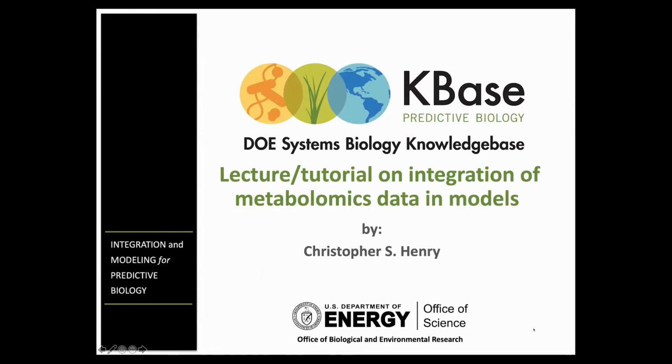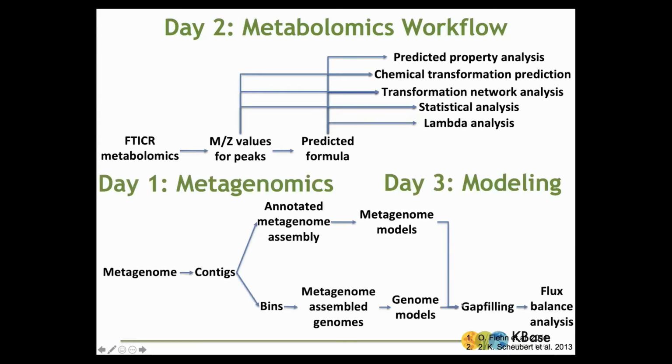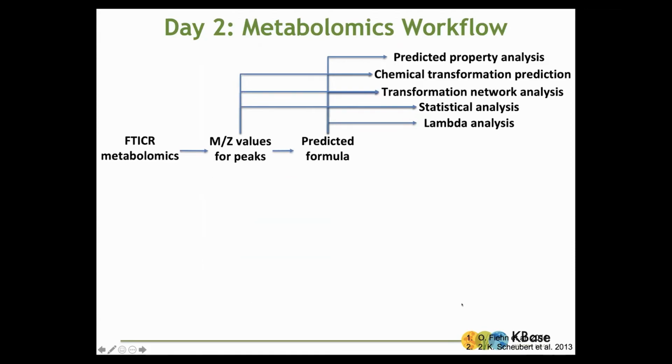All right. Great. So this will be a tutorial on the integration of metabolomics and the modeling. The day 2 workflow that you saw yesterday really covers this: FTICR metabolomics to m/z values for peaks, and then predicted formula using the Formulator tool. And then a whole bunch of analysis you can do with the output of that.